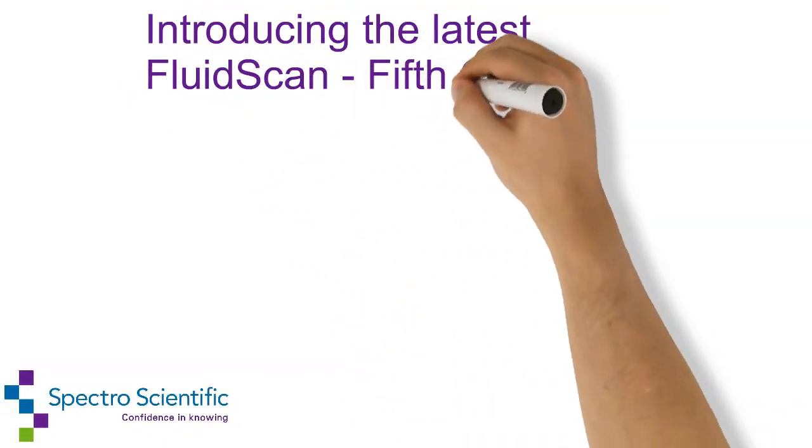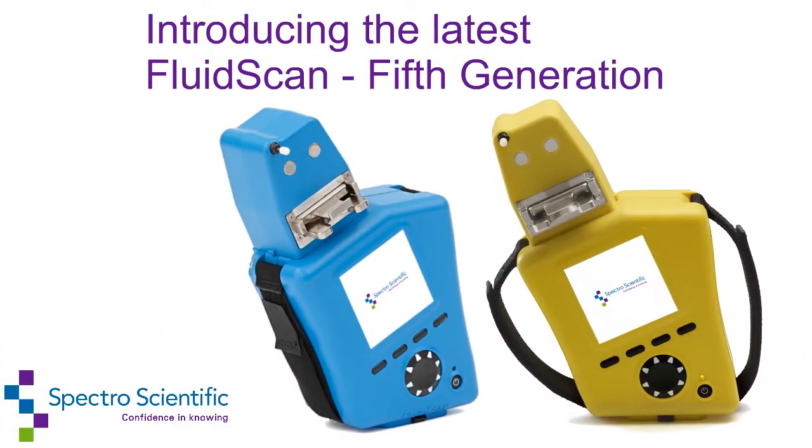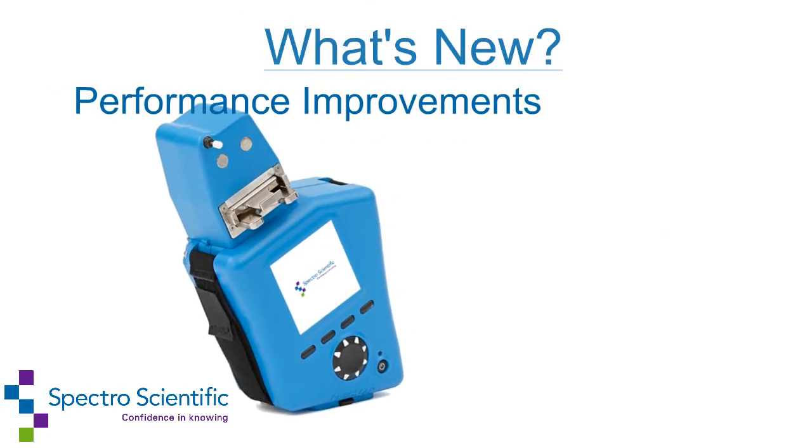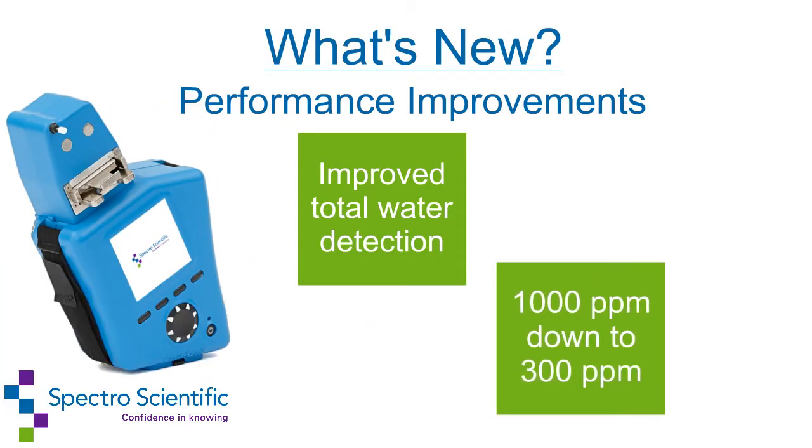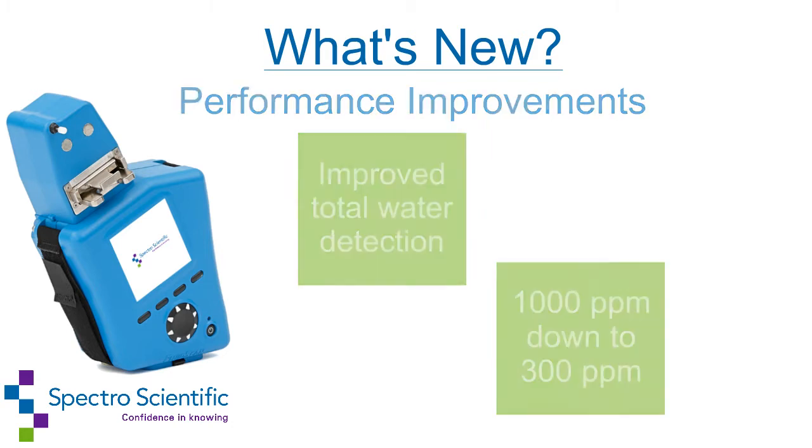Introducing the fifth generation of the Fluid Scan by Spectro Scientific. Some of the performance improvements include improved total water detection from 1000 ppm all the way down to 300 ppm for turbine oil.